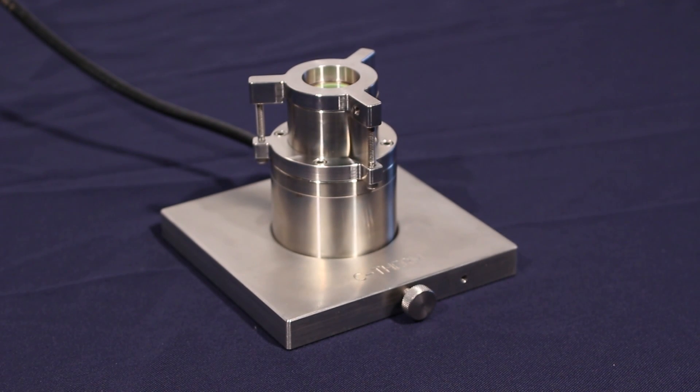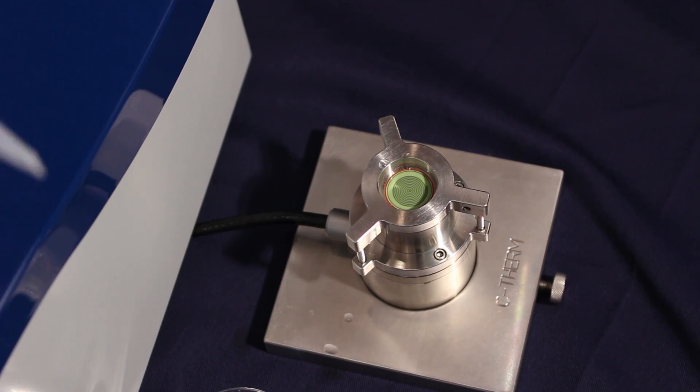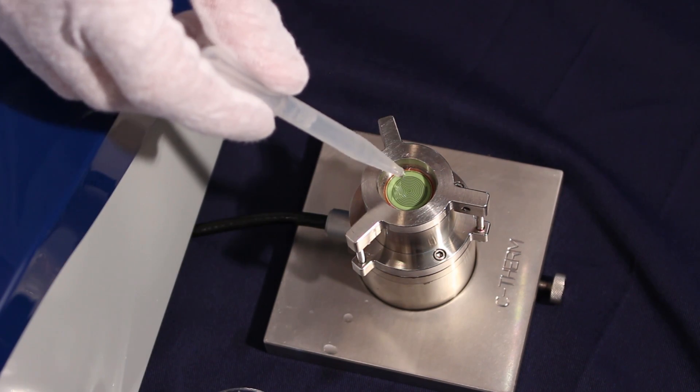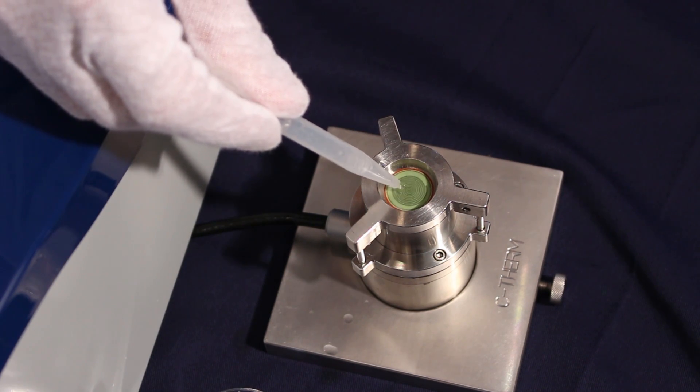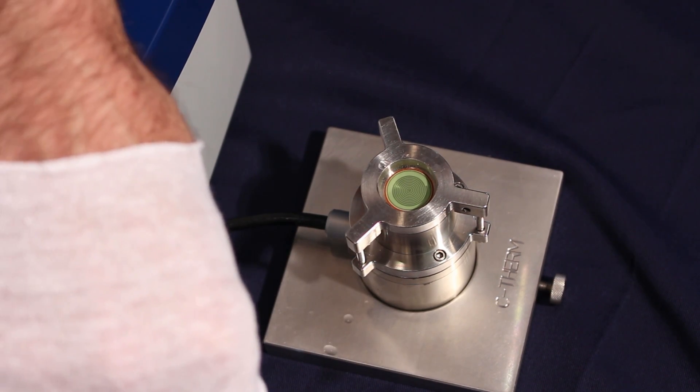So as you can see here we have a small volume test kit which encompasses the sensor itself, creating a void for us to add the liquid. This sensor itself is about 17mm in diameter and we require around 1-2mL of the sample material for effective measurement.